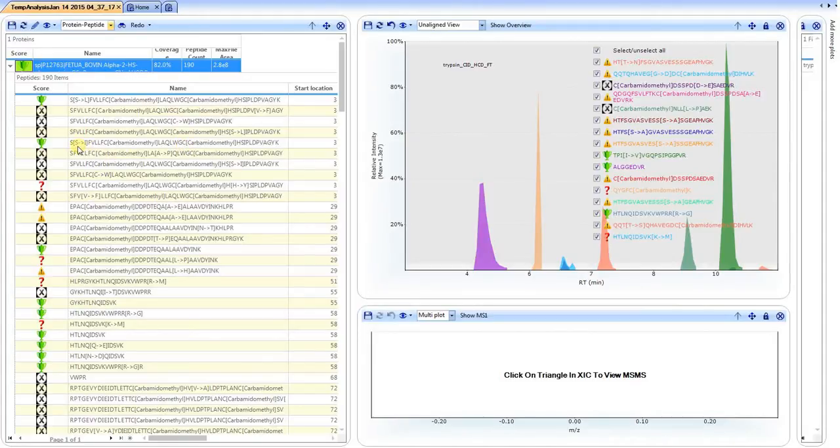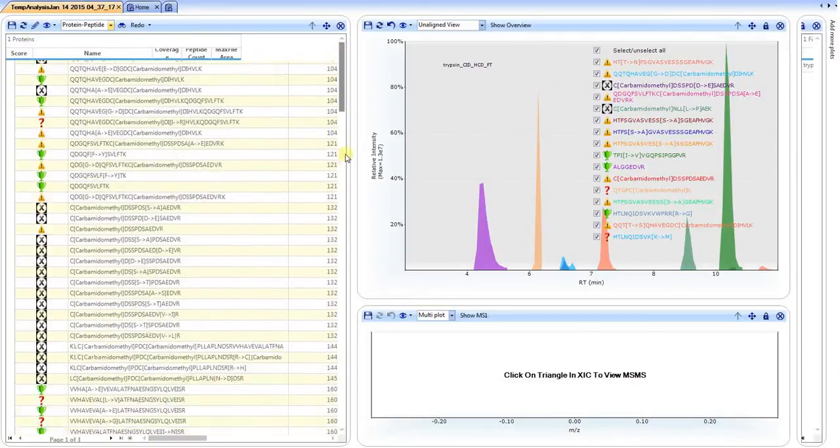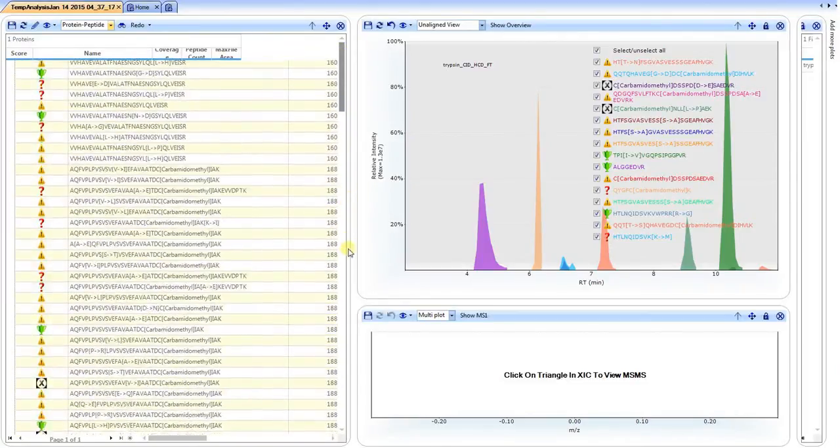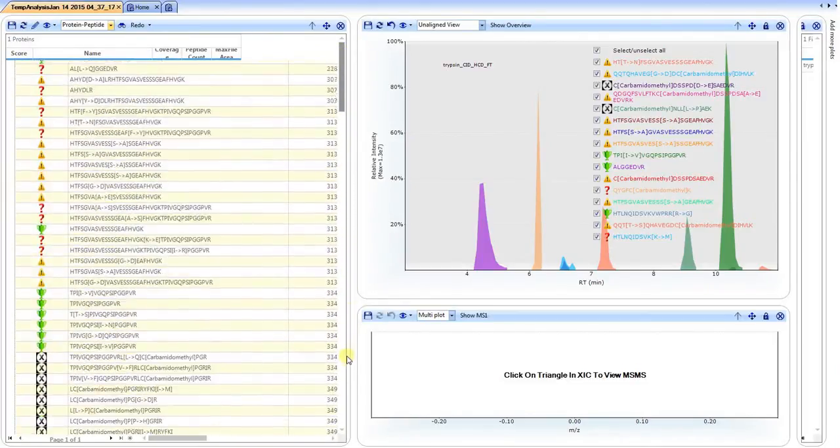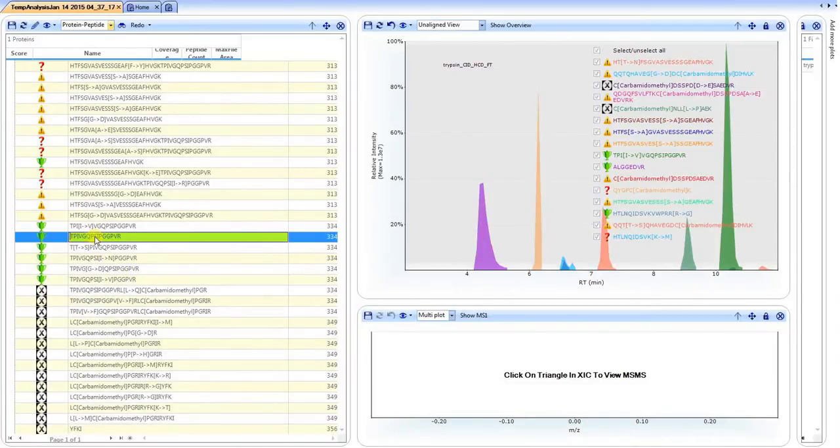The specific SNP is shown here in the square brackets at the site of the particular SNP. If we want to review a possible SNP, we take an example. We would always start with the unmodified form of the peptide if there is one.